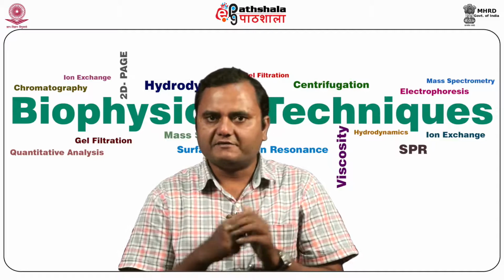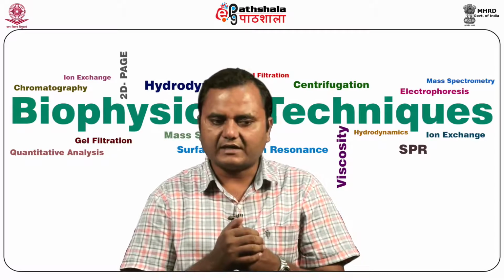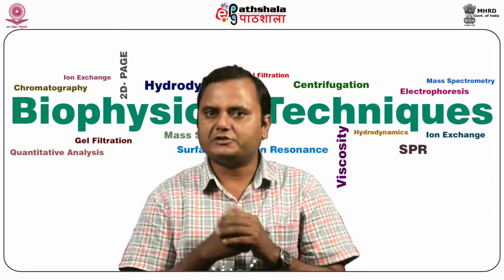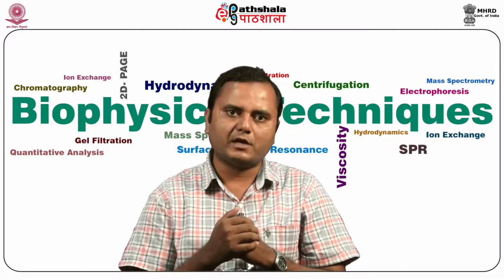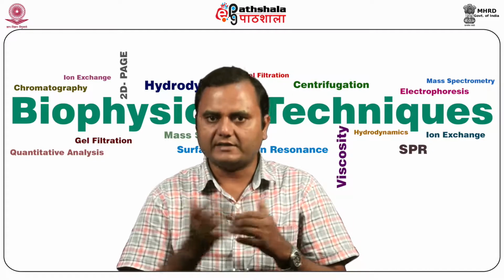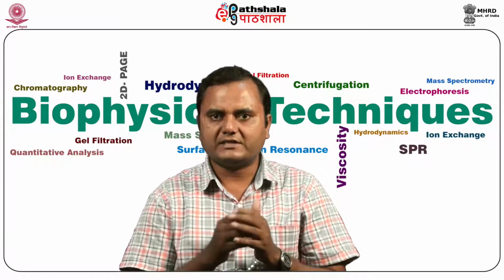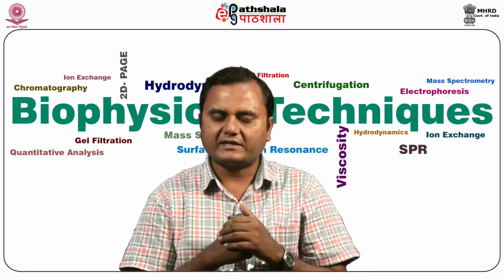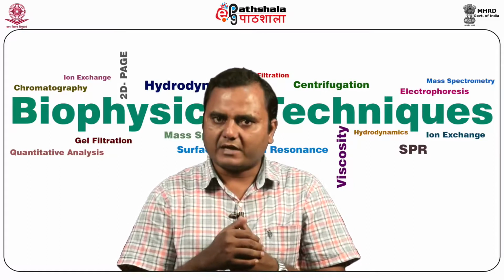Sedimentation of particles in the gravitational field is dependent on the mass, density, or size of the particle, but it is better explained in terms of the sedimentation coefficient, known as S. The S value is the sedimentation velocity of the molecule. This may be measured by sucrose density gradient sedimentation or by analytical ultracentrifugation. The S value of a molecule is determined both by its shape and its mass, so it is a very important factor for the calculation of the biophysical properties of the macromolecules.